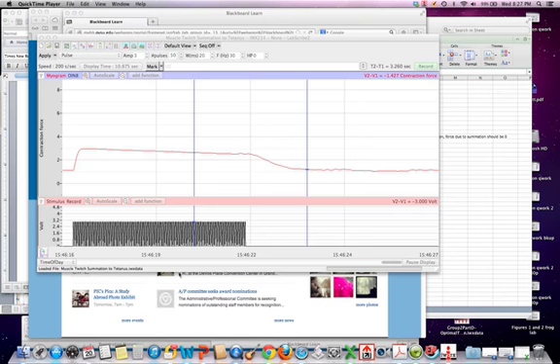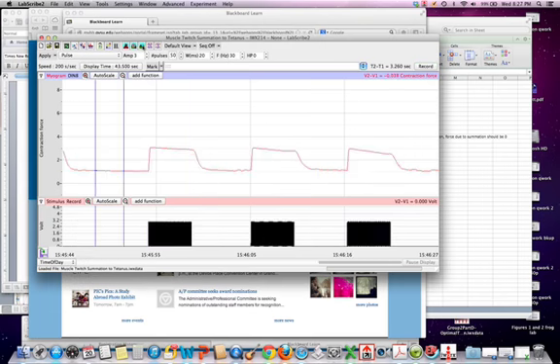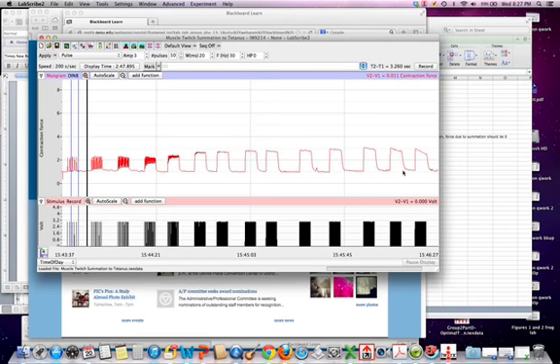Looking at the muscle summation of tetanus. I'm going to zoom out so I can see the entire data set. There we go. Now we can see that entire data set, and we have all of these different hertz. It hasn't been written down here, but you guys went in a very systematic way, so you know from your notes what each of these represent.